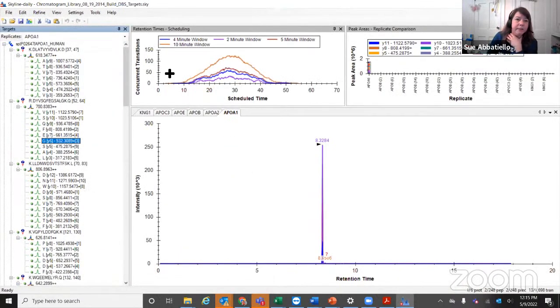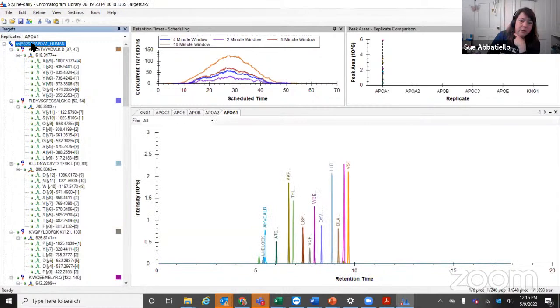Then we've got this Skyline file. Now this has been pre-populated for all of you with the protein accession number and the protein code name, and then peptides that have been filtered based on digestion settings. So what I'm going to show you first is, if you hover over this, you click it and you hover. Nope, you click it.